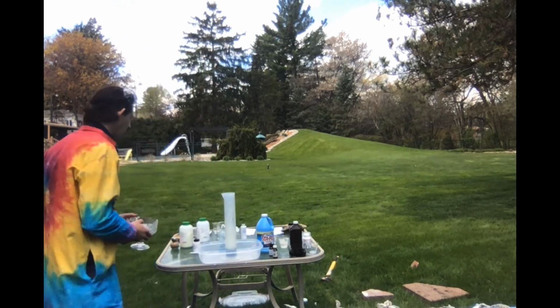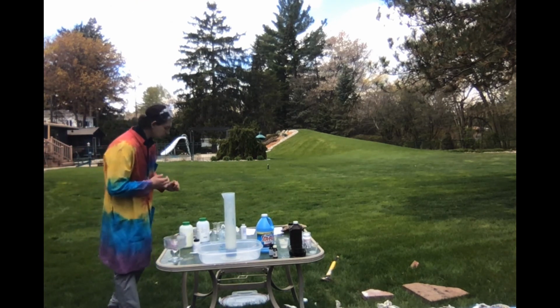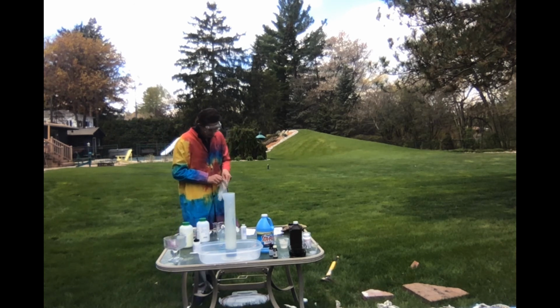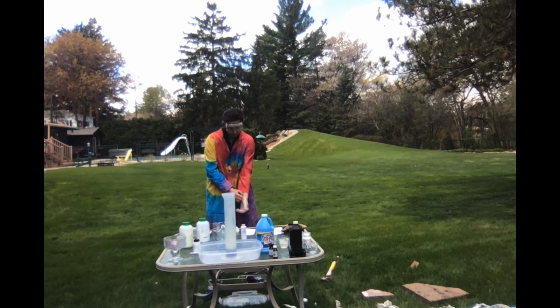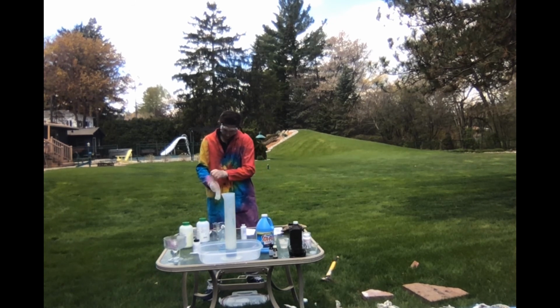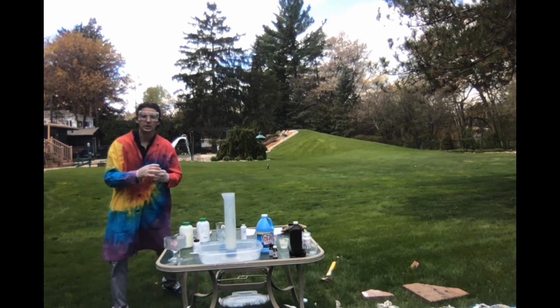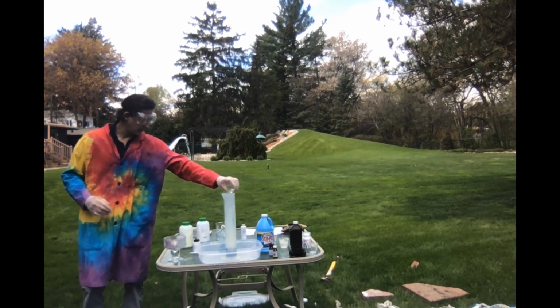All right, so on to our last one. Let's see what we have here. Goggles on. Like I said, this is number 10, elephant toothpaste. We have potassium iodide in water in this small beaker, and then hydrogen peroxide, soap and food coloring in this big beaker. All right, let's see what happens.